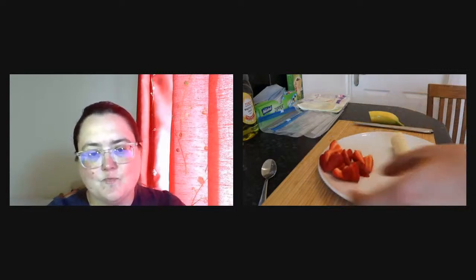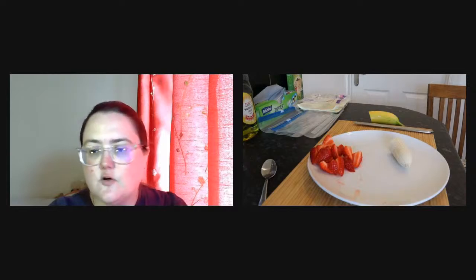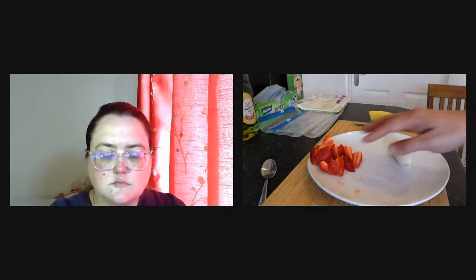Okay, so we have our fruits cut and ready to go. What we are going to do is basically break up the fruits. Do you know why we do that, Claire? No, why do we do that then, Remy? Actually the DNA is inside the cells. It is protected from the outside of the cells by the cell wall and some membranes. Because the DNA is inside the cells, we are going to break the cells so that we can access the DNA which is inside the nucleus. And to do that, we cut those fruits.